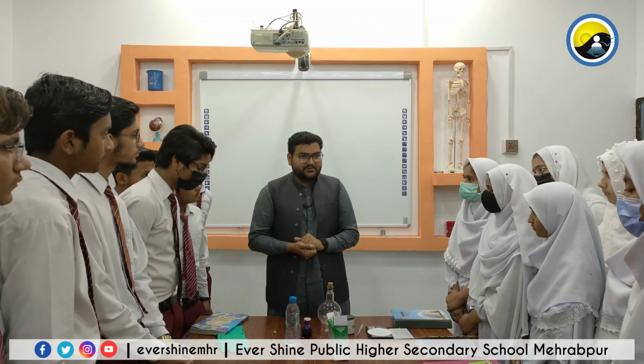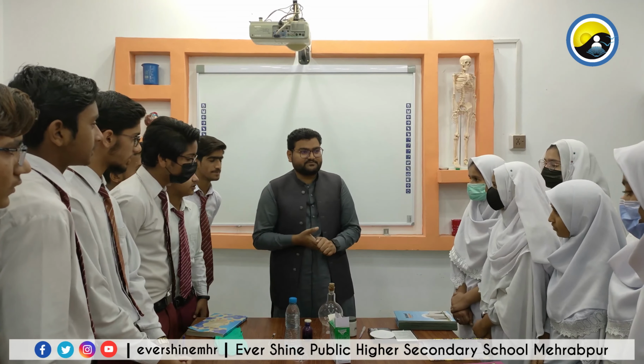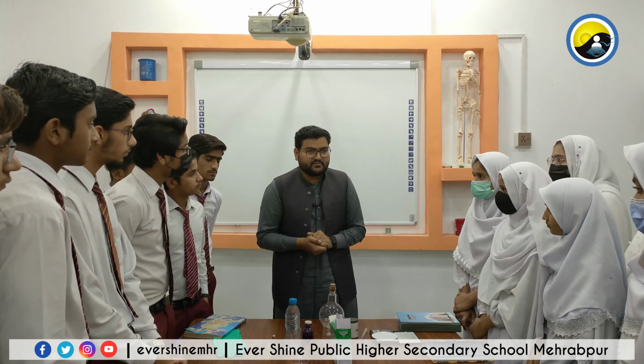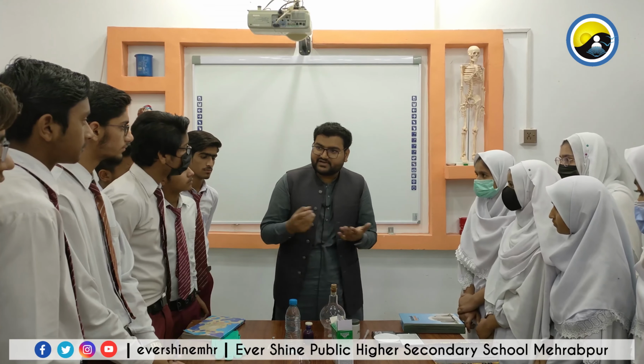Hello students, Assalamu alaikum. Today we are performing a redox reaction. Does any one of you know what a redox reaction is? It is a reaction in which reduction as well as oxidation occurs.